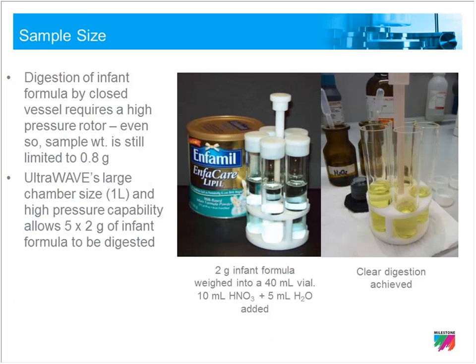Okay, I'll skip forward to this slide, on sample size. Pressure capability in the ultrawave is 200 bar, and sample size is important sometimes, either for detection needs, as I mentioned, or sample homogeneity, gathering a representative sample. In the ultrawave, we digested 10 grams of infant formula at one time using the 5-position rack, so 5 2-gram samples, and digested it completely without incident.